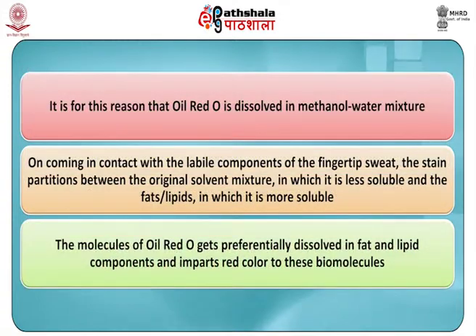It is for this reason that oil red O is dissolved in a methanol-water mixture. On coming in contact with the labile components of the fingertip sweat, the stain partitions between the original solvent mixture, in which it is less soluble, and the fats or lipids in which it is more soluble.